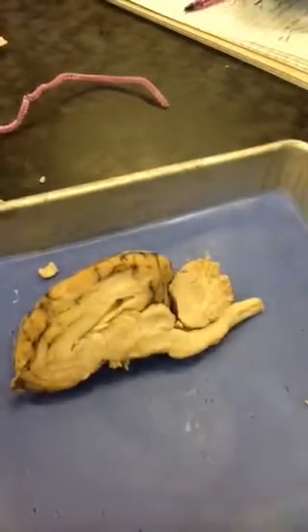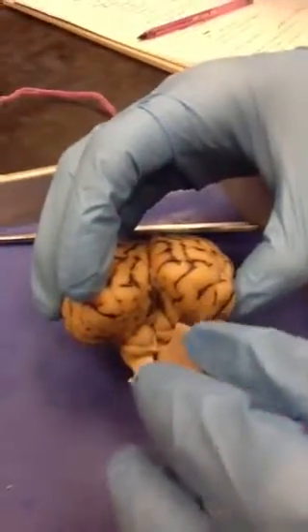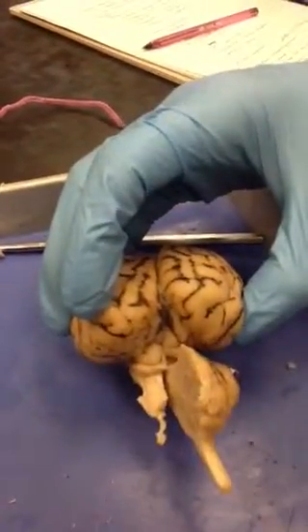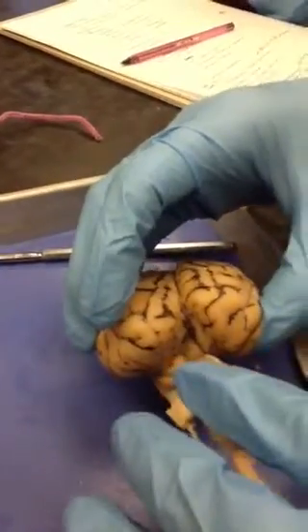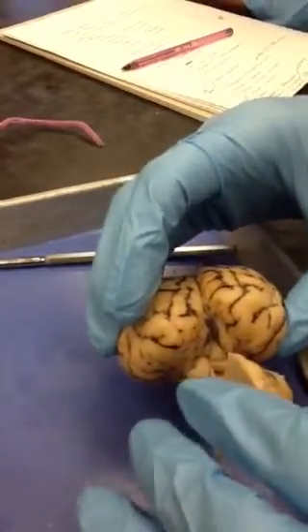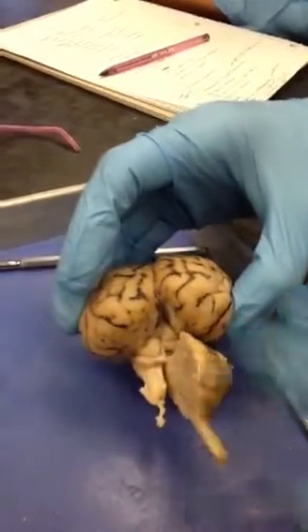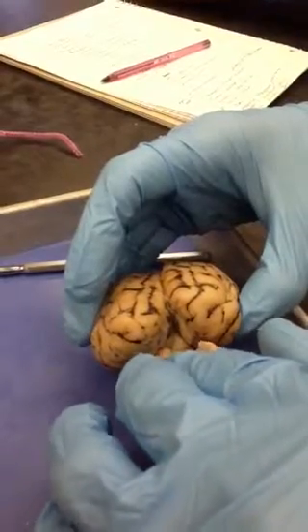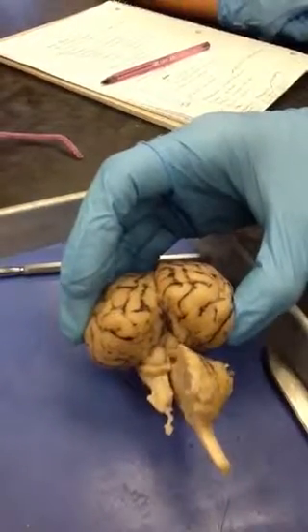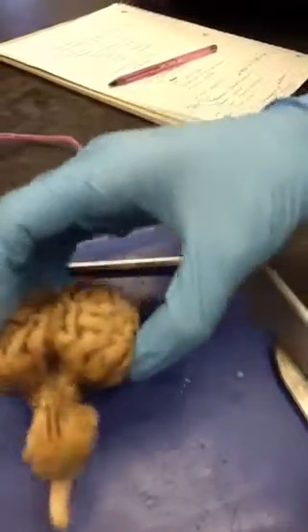And finally, let's put these all together. Back here you have the four. Together they're called the corpora quadrigemina, and individually they're called colliculi. So you have the two superior colliculi, which are the first relay station for vision, and then the two inferior ones are auditory, the first relay station for auditory.